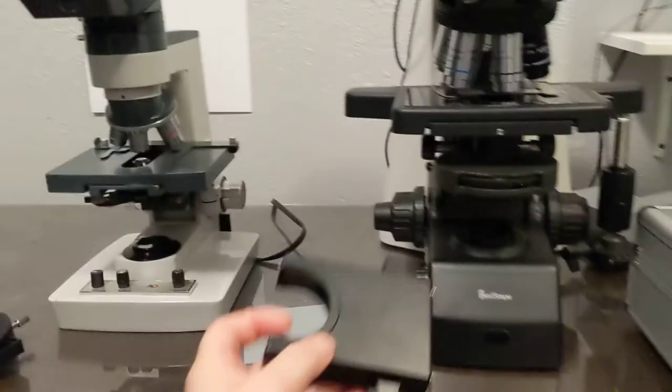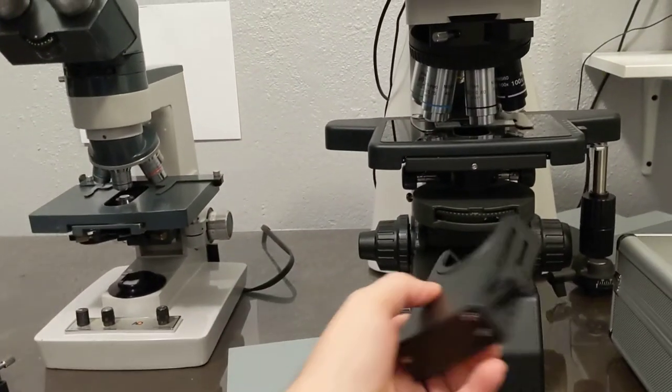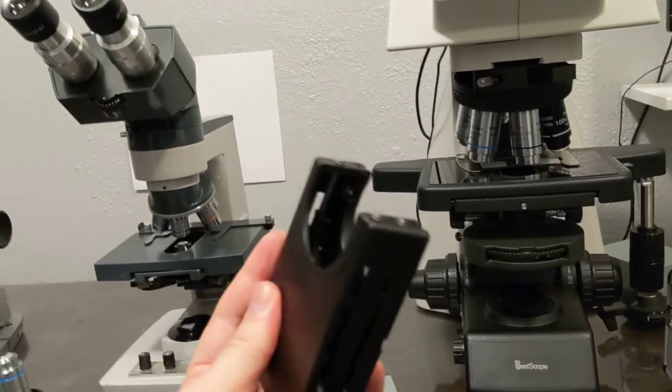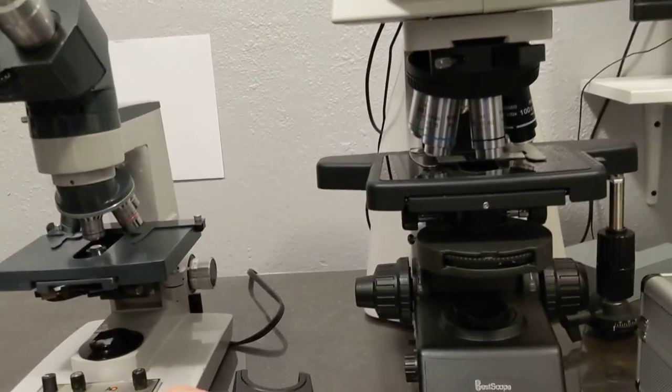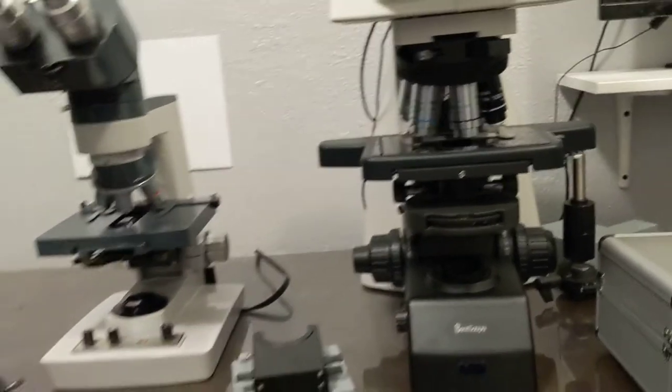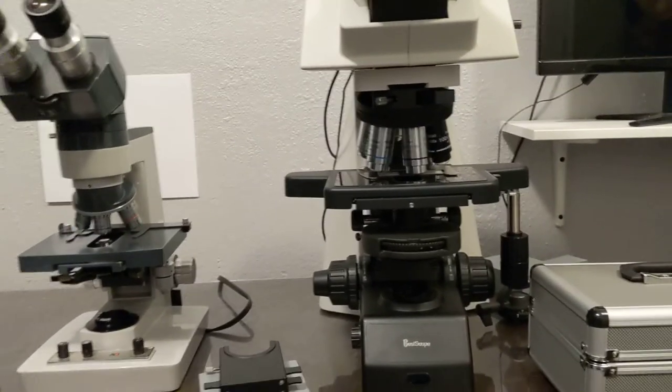This is a filter holder that I bought with it. It was really cheap and goes over that. You can put a red and a green filter and a blue filter. But I don't end up using them very much. I might use them more if I spend more time with phase contrast.